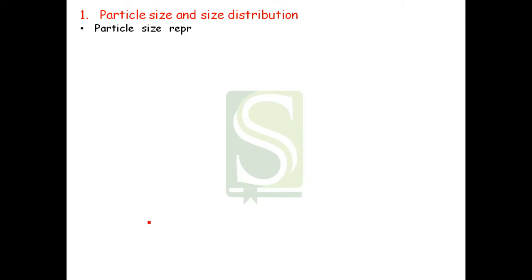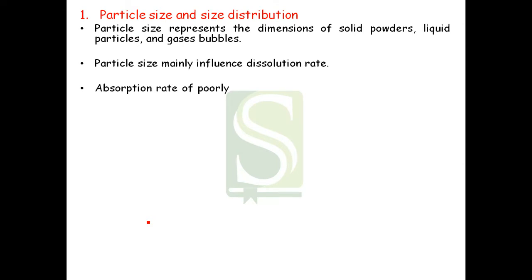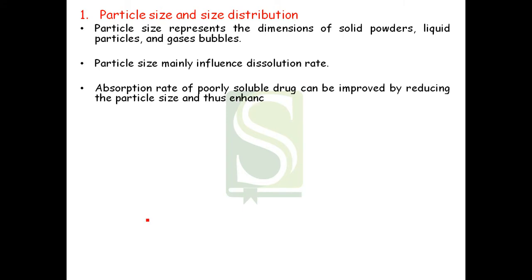Now we will see in detail about particle size and particle size distribution. Particle size represents the dimensions of the solid powders, liquid particles and gas bubbles. Particle size mainly influences the rate of dissolution, and ultimately it is going to affect the rate of absorption.